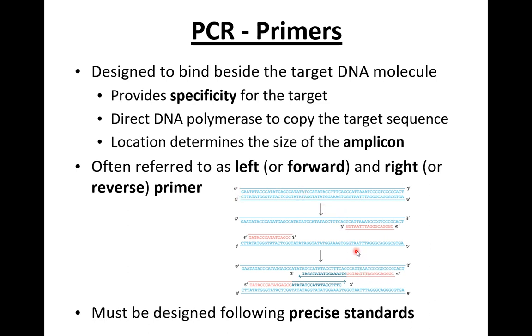And one important thing is that always the direction of these primers, obviously this one has to be pointing to the DNA polymerase so that it will go over the target sequence.